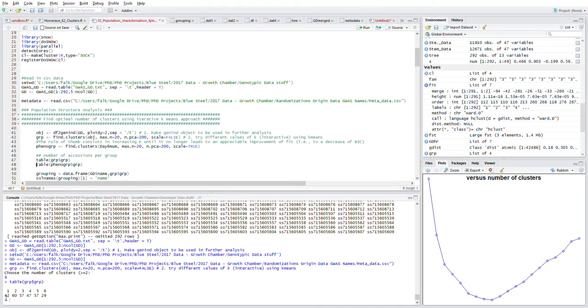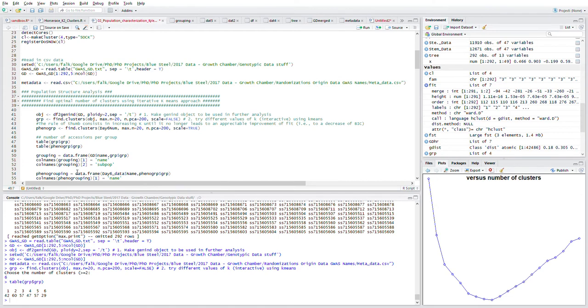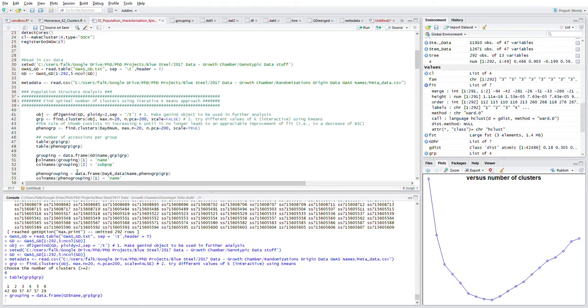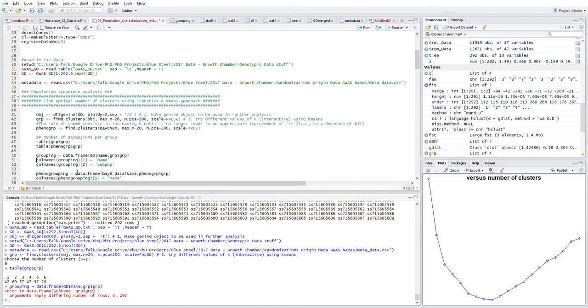For my six clusters, I've got the genotypes split up quite evenly. Basically, now that I have a list of the genotypes and the clusters that they're going to be in, I essentially just want to create a data frame.